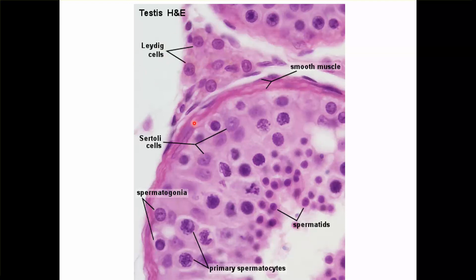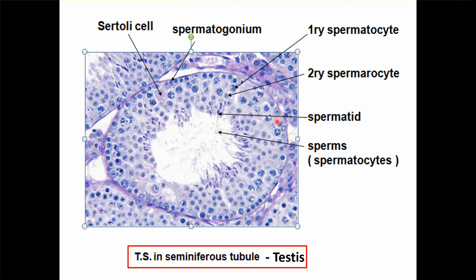This is smooth muscle. These are pale cells which are Sertoli cells within the seminiferous tubules. Here you can see the different stages of sperm formation. You have the spermatogonia towards the base, then the primary spermatocyte which is large in size, then secondary spermatocyte, then the spermatid, and then the sperms with the tail towards the center.